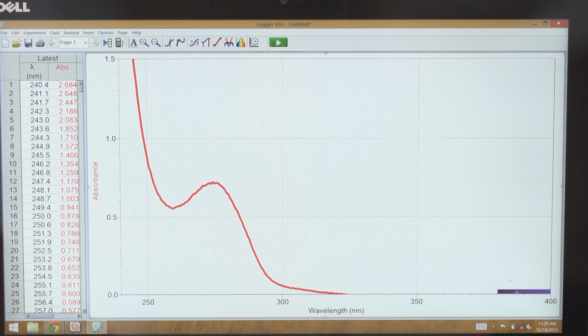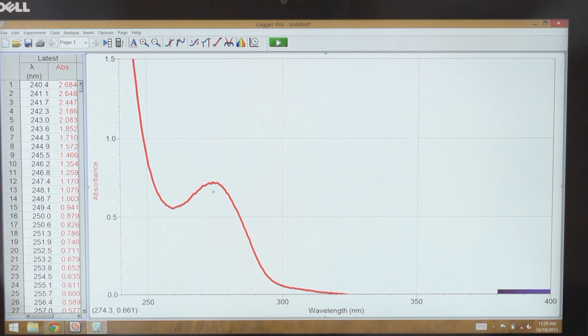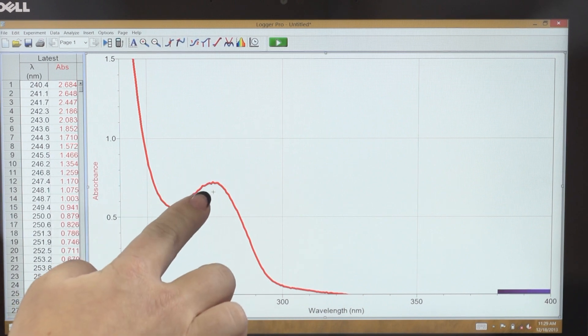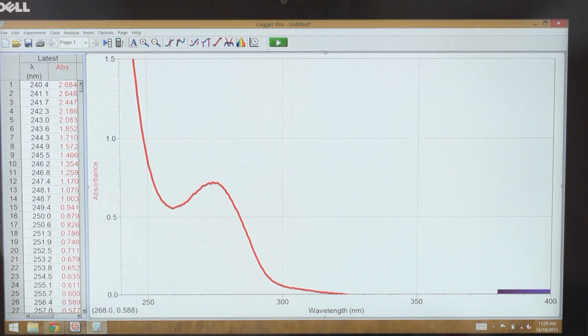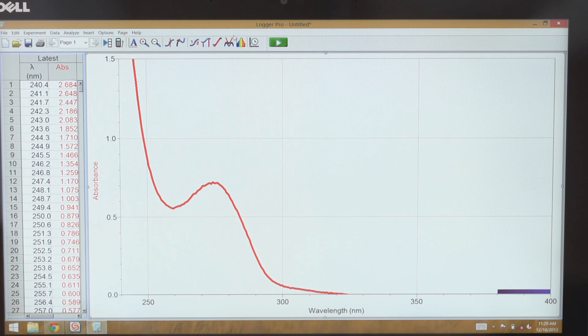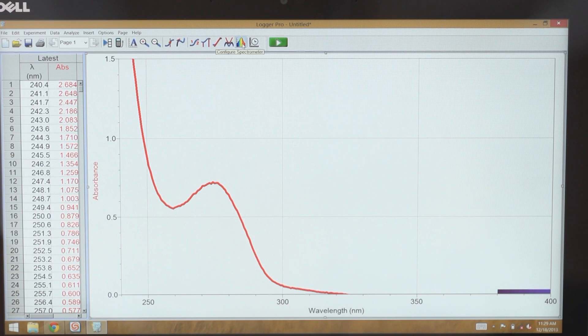So now I want to do a Beer's Law experiment at the wavelength of the peak absorbance here for aspirin. So in order to do that, I tap on this rainbow icon that's about in the middle of the toolbar. It's also the configure spectrometer icon.